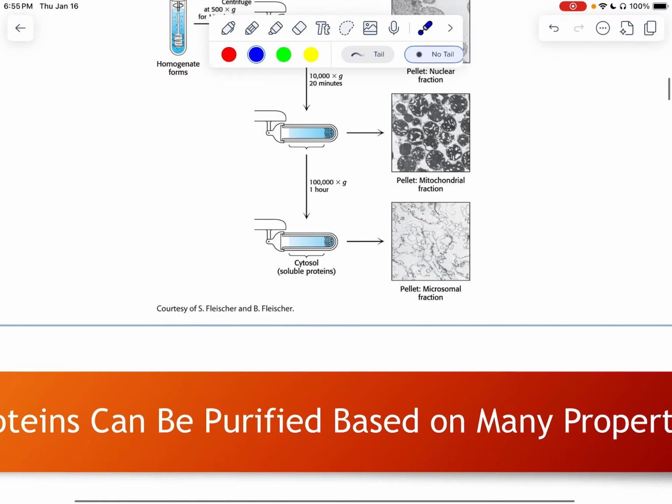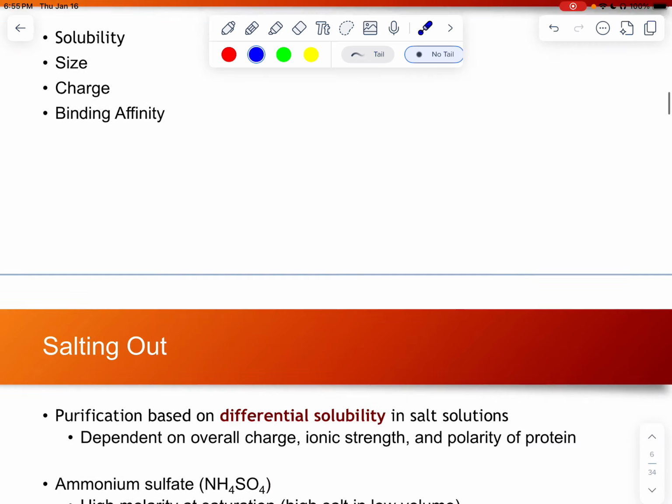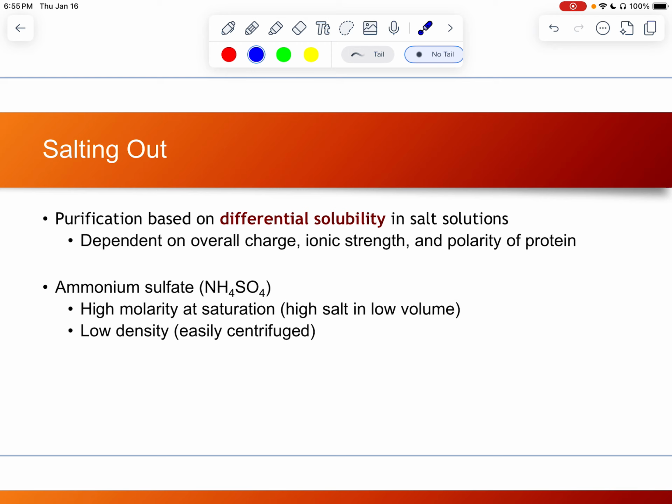Then we want to really purify those proteins, and they can be purified based on many of their chemical and physical properties: their solubility, their size, their charge, their binding affinity. Lots of options. The first thing we want to talk about is one of the simplest, the idea of salting out. This is differential solubility. Some proteins are more or less soluble than others. Salting out will depend on the overall charge of the protein, ionic strength, and polarity. And the salt that we often use is ammonium sulfate.